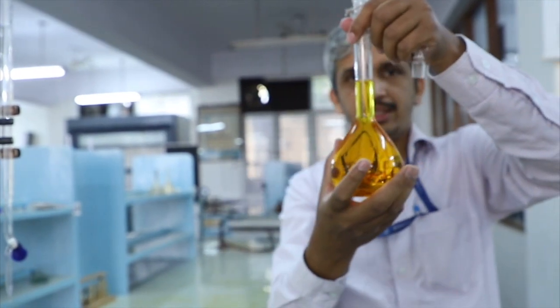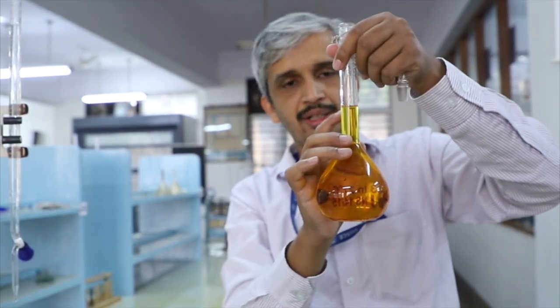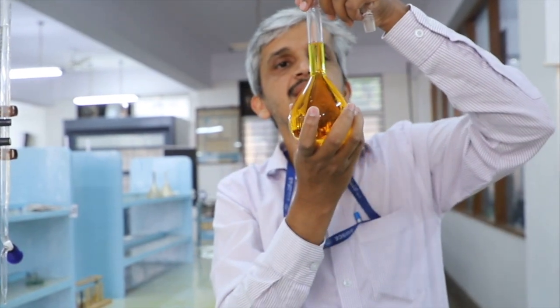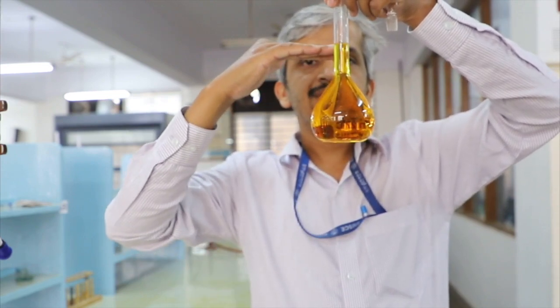flask. Okay. So we are seeing the lower meniscus, even though it is a colored solution, the intensity of color is very less, it is very lightly colored. As long as you can see the lower meniscus, you can go ahead with the lower meniscus. And the other thing is, while reading the burette reading, or while measuring the solution in pipette, you have to keep to your eye level. The eye level and this mark should be at the same level.